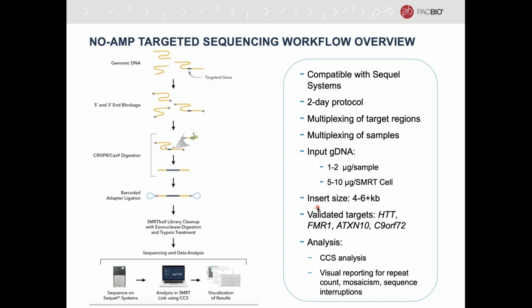The insert size that we have mostly worked with in-house is 4 to 6 kb. That said, we've done some tests for larger inserts like 16 kb successfully.